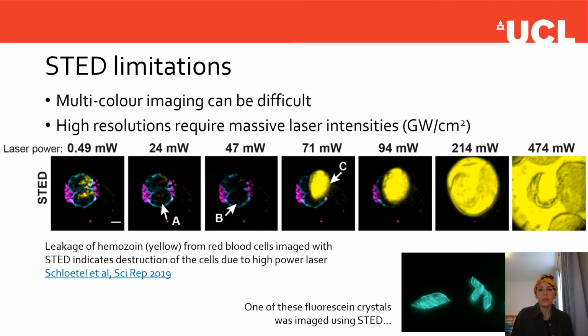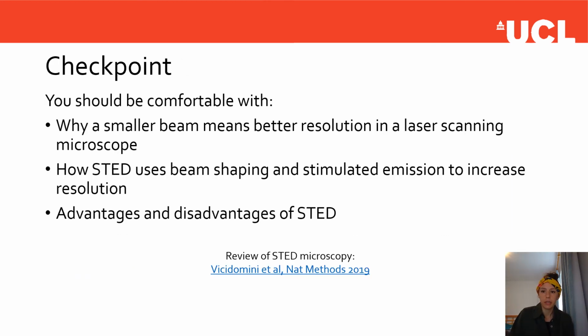So that's all for the first talk. Hopefully regarding STED, you should be comfortable with why a smaller beam means better resolution in general, how STED uses a combination of beam shaping and the photophysical process of stimulated emission to increase the resolution, and the advantages and disadvantages of STED microscopy. And this is really nicely reviewed in this paper here.